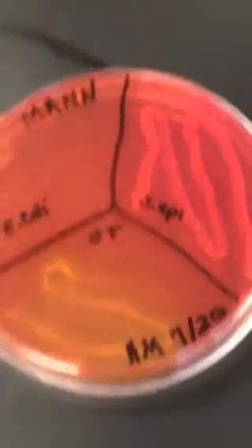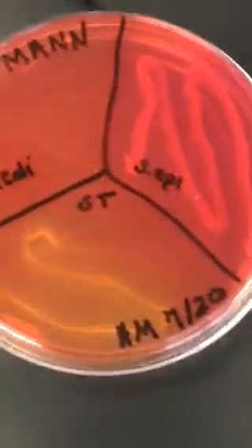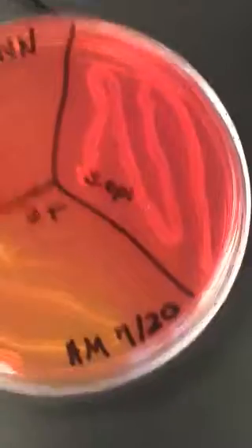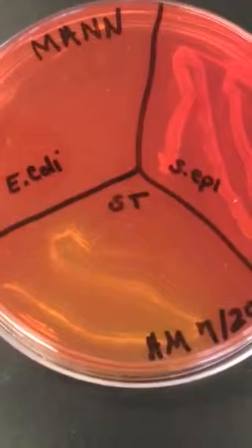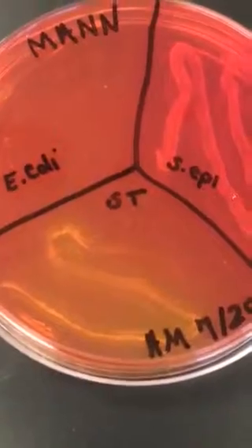You're covered with Staphylococcus. You go for a jog, you start sweating. You come home, you're all sweaty, your dog runs over and starts licking your leg. Because you taste salty. He's licking the salt. He likes the taste of the salt in your sweat. Staphylococcus like your salty skin too. So that's why they grow so well on our skin. Not so well on nutrient agar because there's no salt in it. There's just a little bit. The mannitol salt agar has salt added to promote the growth of gram-positive Staphylococcus. Not just gram-positive, specifically gram-positive Staphylococcus.